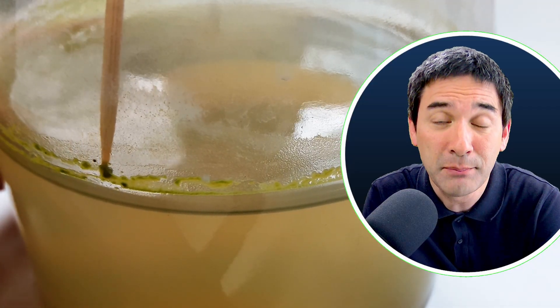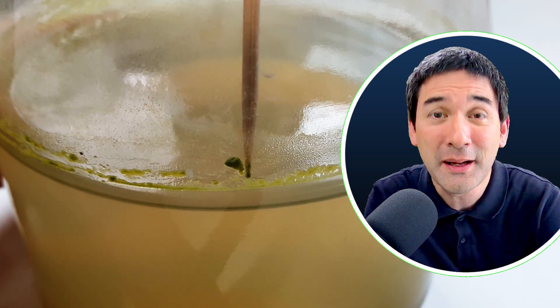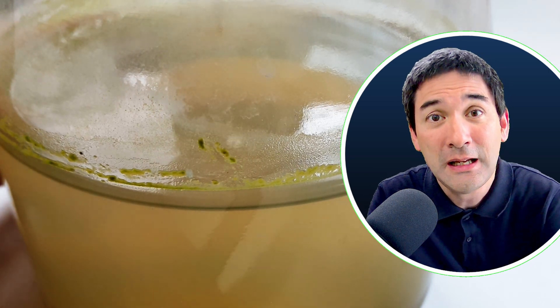And I've scratched off a sample here and put it under the microscope and indeed there are many microscopic algae visible. And in this video today, I would also like to explore a little bit the idea to what extent those algae, those microscopic algae, can be used also to reduce global carbon dioxide in the atmosphere because those algae, just like plants, they do photosynthesis and they absorb carbon dioxide and convert it to biomass.